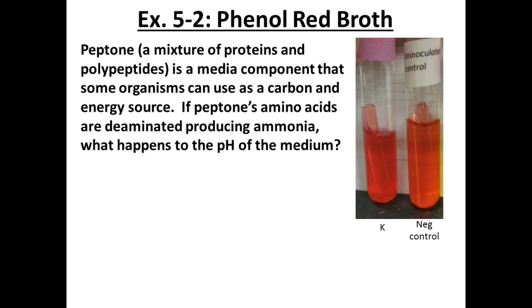Yeah, there's different size bubbles. That's why you should indicate what size you think your bubble was. He had a huge bubble. Almost his entire tube is completely removed of media. So small is considered negative. No, small is small.